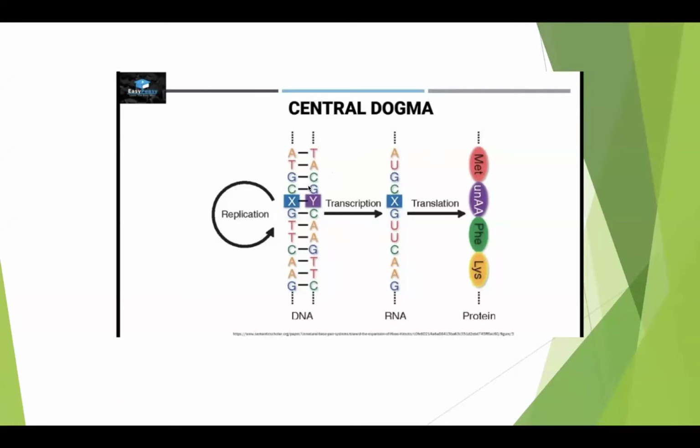The whole reason why I'm explaining this concept is because I want to show you how you can use BioPython to move from this strand, which is the coding strand, all the way to the protein sequence. How we do that is, I'm gonna have to go back to Python now.